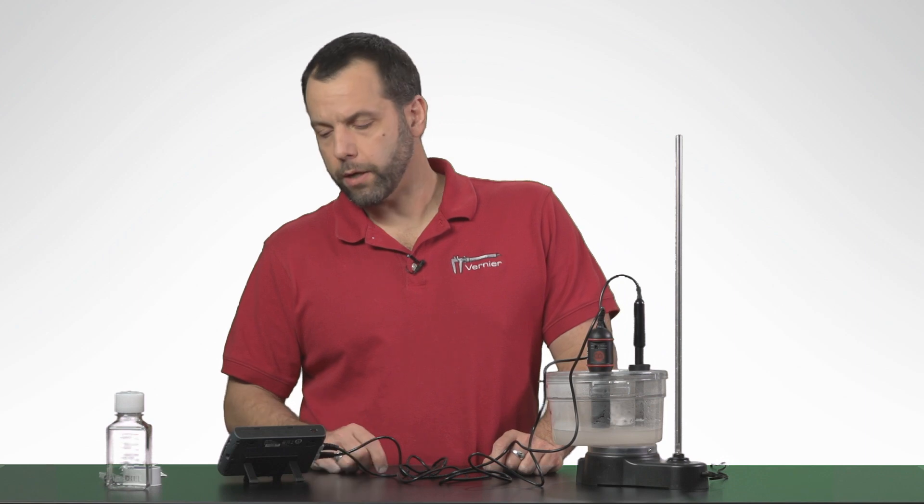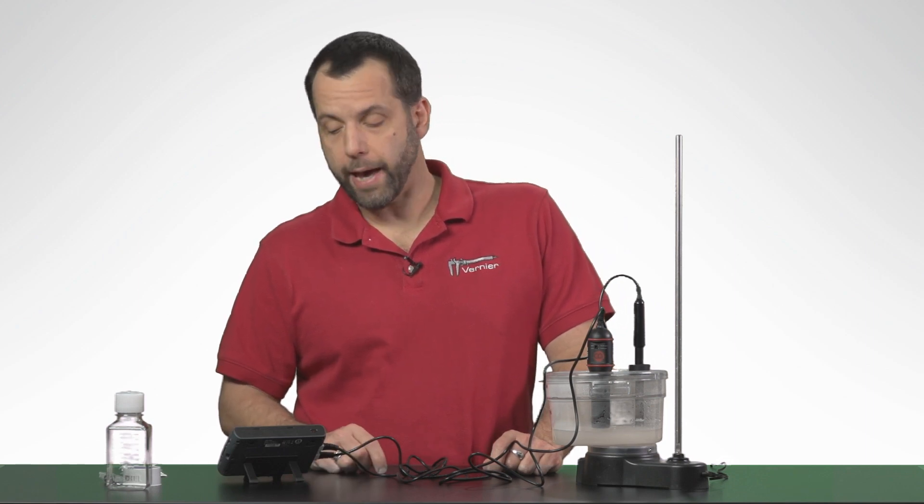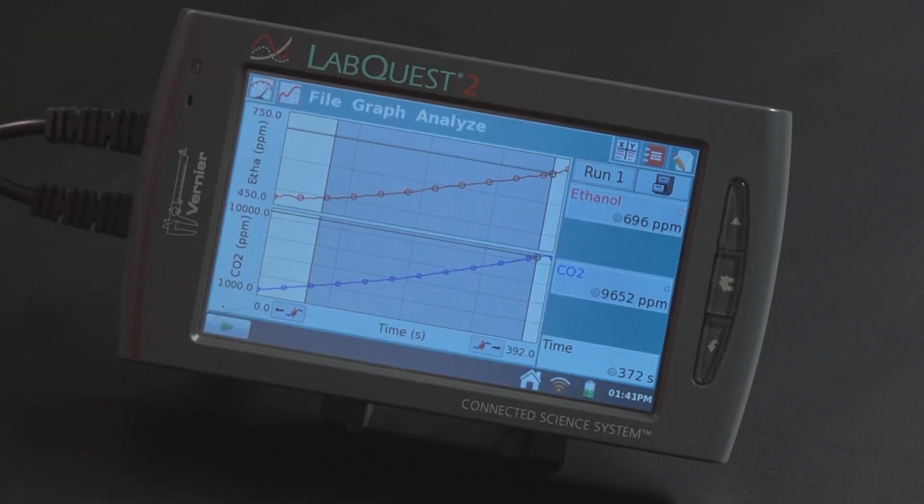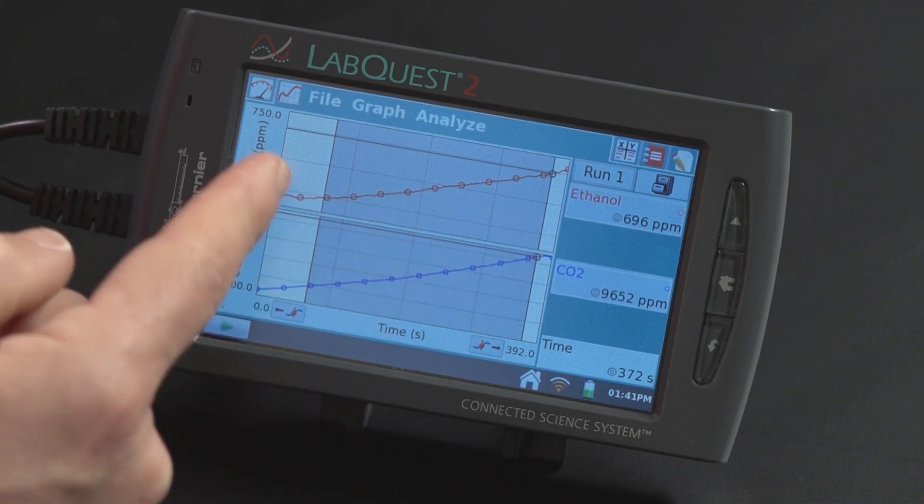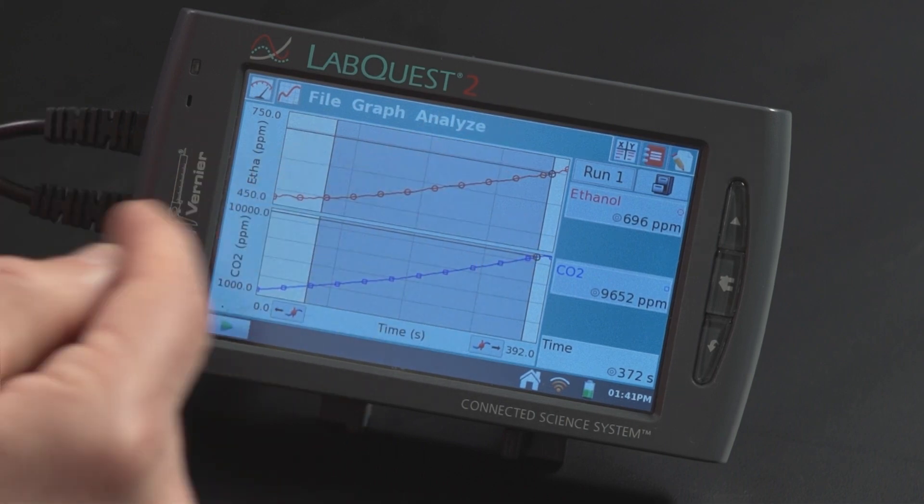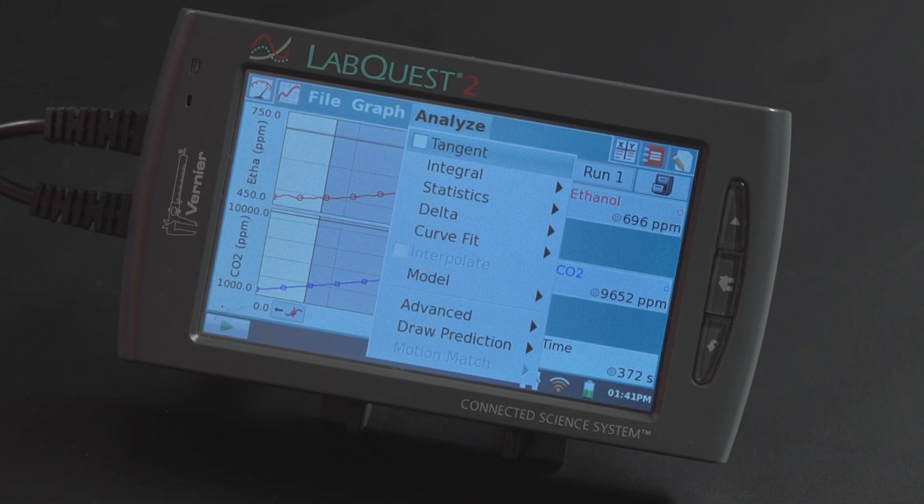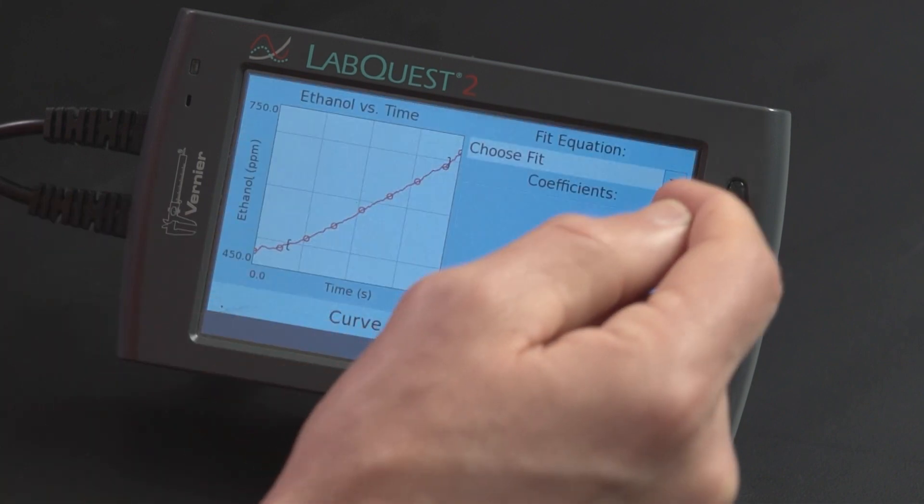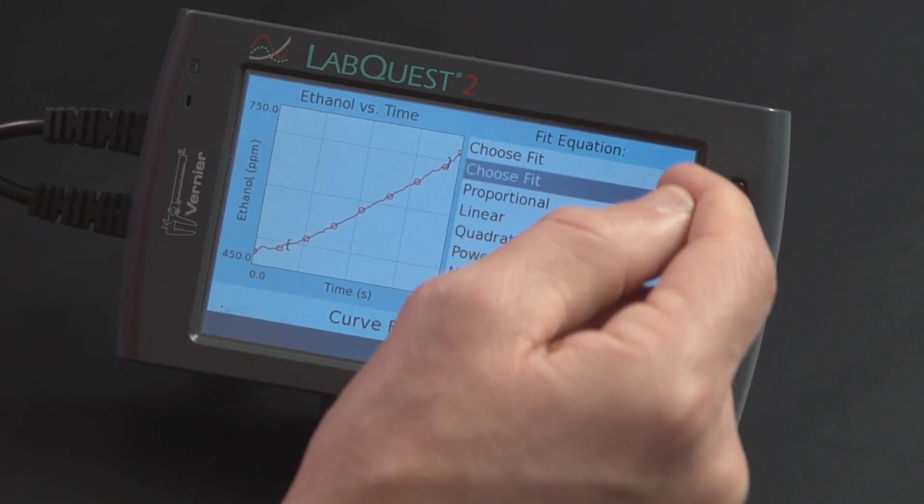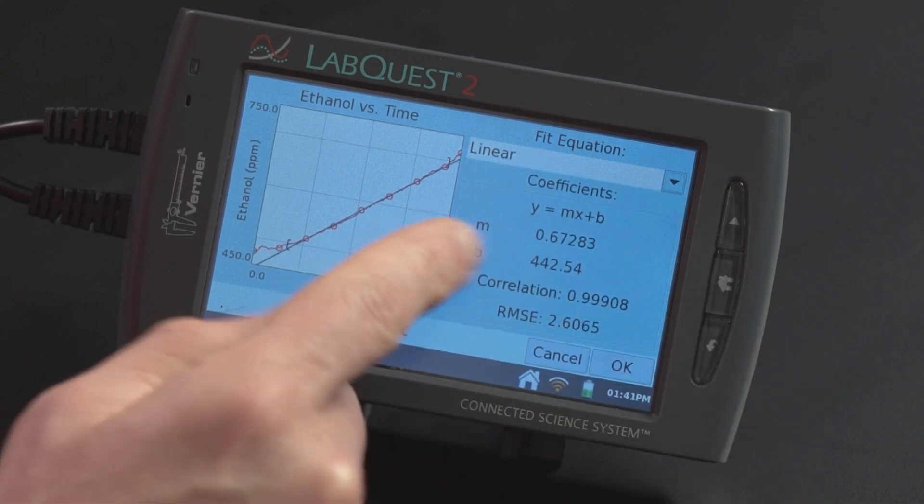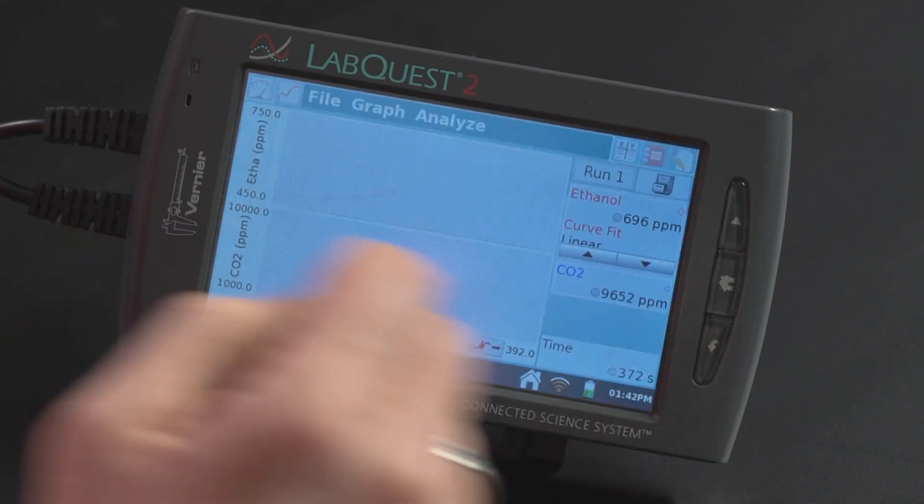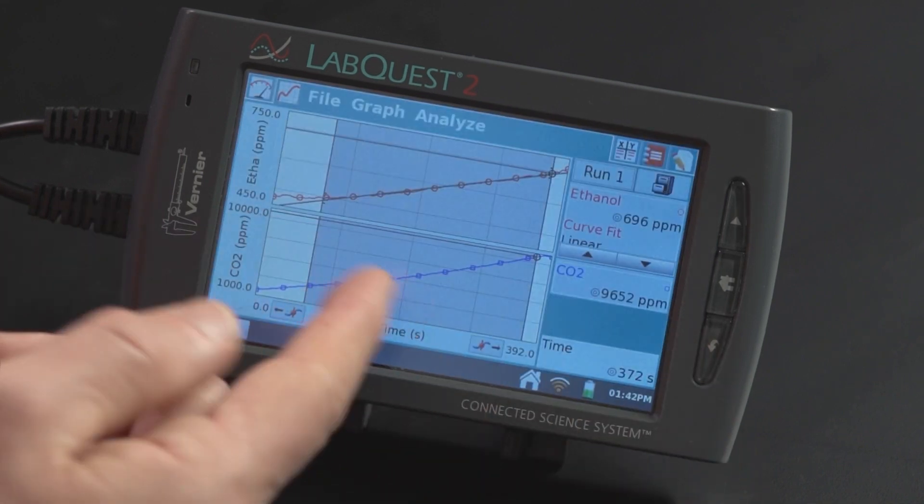So let's just take a quick look and find the rate of production of both of these gases. If I tap on the graph and drag across, that's a nice little region where we see that it's increasing. I can just tap on Analyze and I can select Curve Fit and then I can pick either one that I want. I can pick Ethanol and then I'm going to choose Linear. And you can see that the slope there is about 0.67.